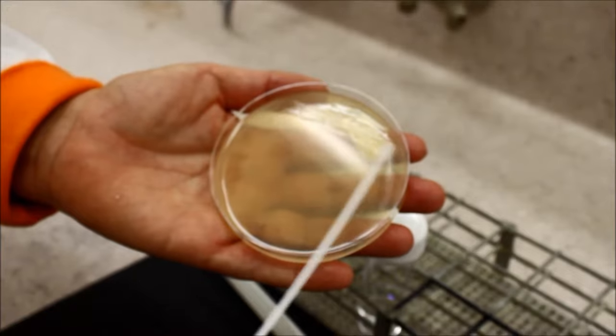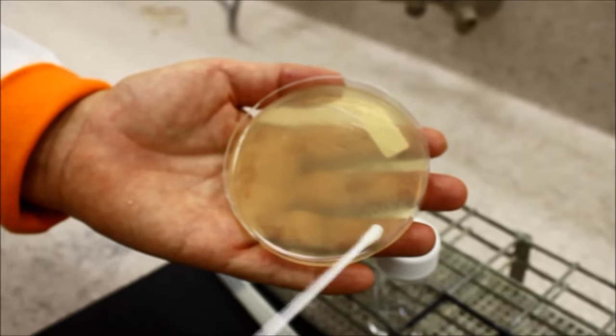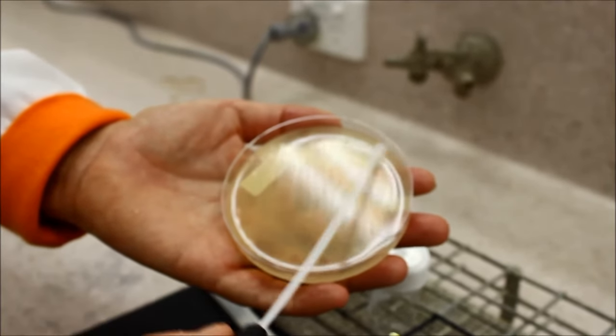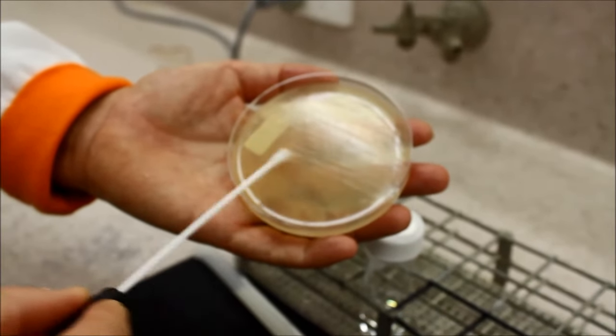Carefully swab the entire surface of the agar plate, ensuring that the swab overlaps each time to evenly distribute the inoculum. Then turn the plate 120 degrees and swab again. Repeat.